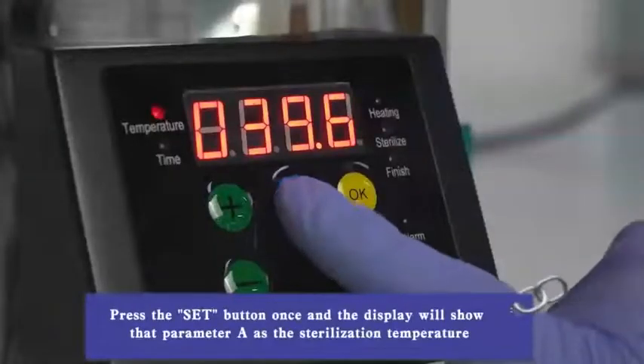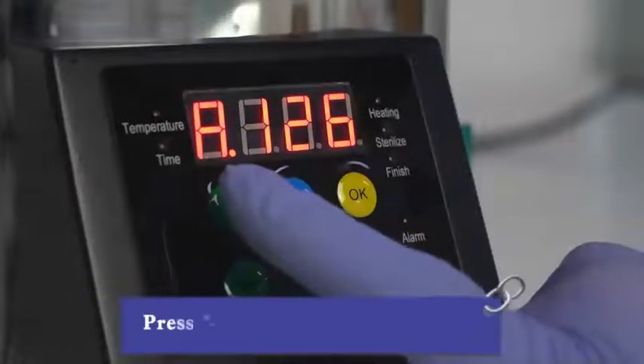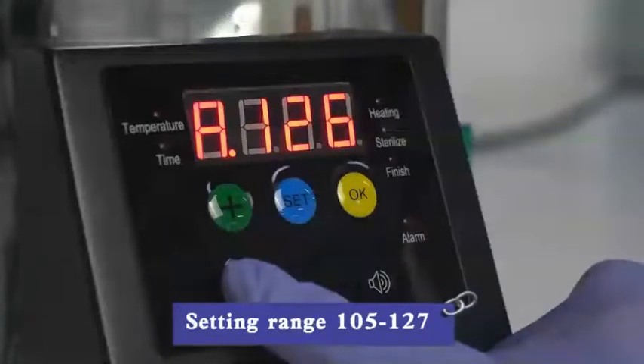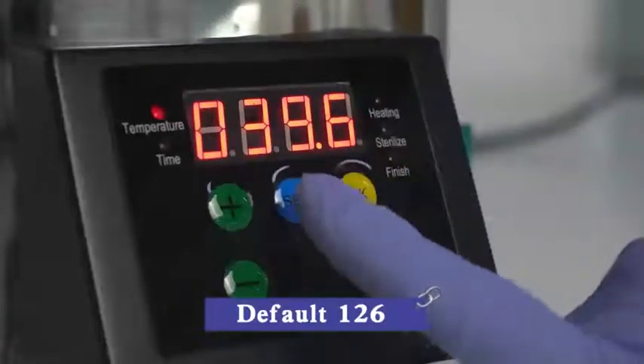Press the SET button once and the display will show parameter A: sterilization temperature. Press plus or minus to modify the value. Press OK to save and exit. Setting range 105 to 127; default is 126.